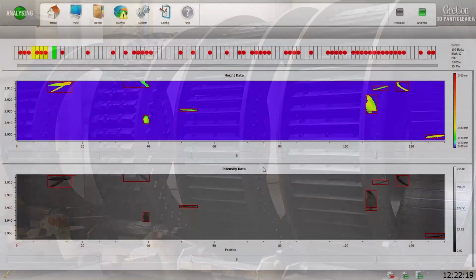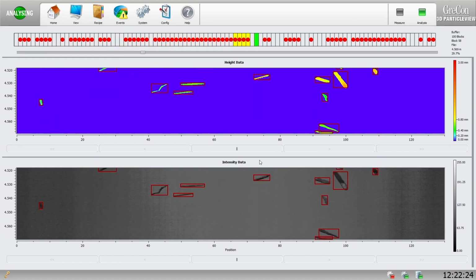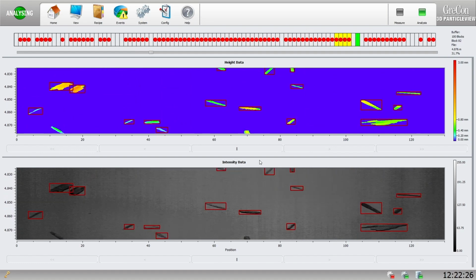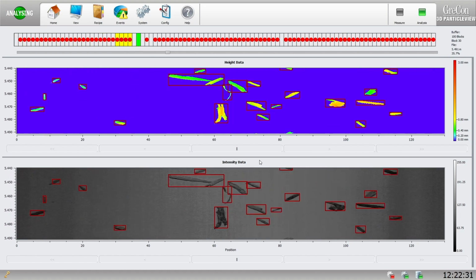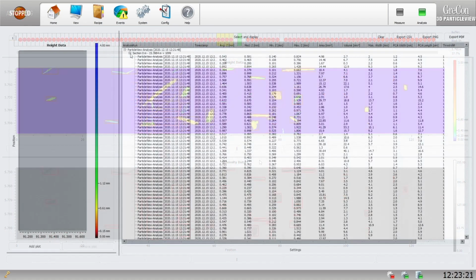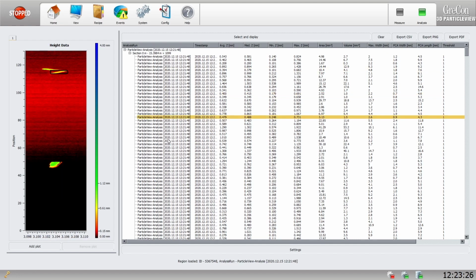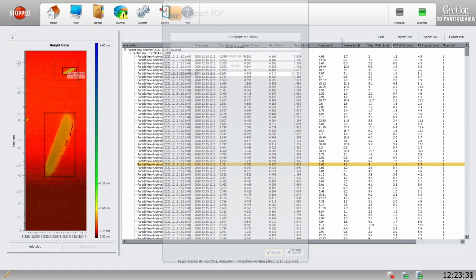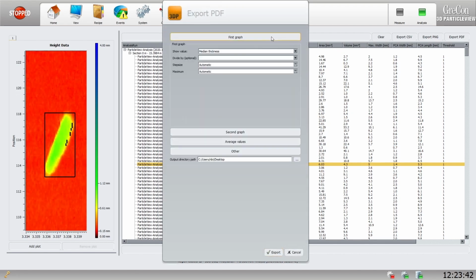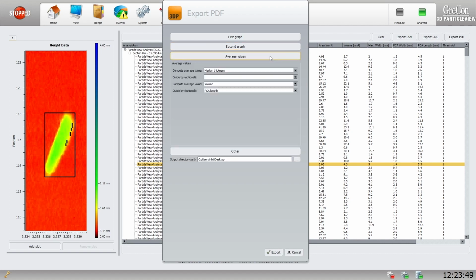By permanently measuring the particle geometry, it is possible to optimally adjust the downstream processes and the change of the knife rings. The main screen shows the detected particles in a false color view. The different colors represent the thicknesses of the particles. The other displays are for data processing and further analysis of the measurement. The table view allows you to call up measuring results and individual particle data and also export to a CSV file for further analysis. A PDF report can be individually configured regarding the printed parameters, and the axis division provides a quick analysis of the measuring results.